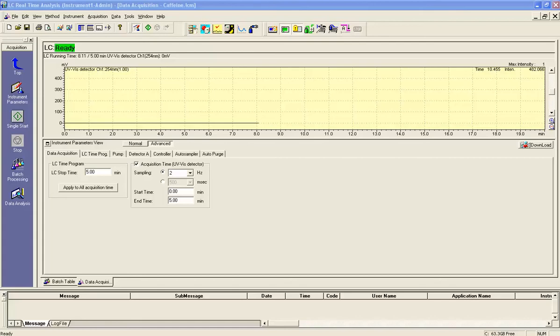Previously, we talked about the LCSolutions software and just how to access it from the desktop and maybe what a few of the buttons mean, not many of them, but a few. And now we're going to go even further into detail on the software. And it's going to be so much, hopefully, not really, but you'll be ready to just put a stop to this video at the end of this one and say, no more of this software, I can't take it, please.